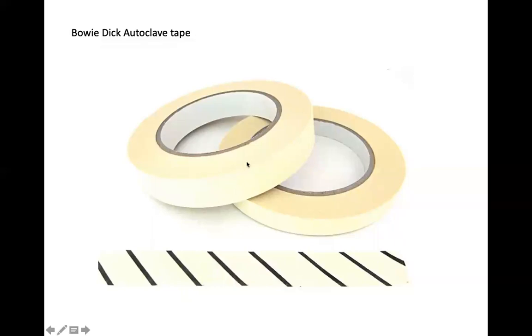After it has gone through the autoclave, you use this tape, you wrap it around items that are going into the autoclave, okay? After the sterilization process is complete, if that item or package got to 120 degrees, then you're going to observe this color change. If there was a malfunction with the heating system, or the perfusion of air or steam was not sufficient, then there are not going to be these black lines. The color change from colorless to black, you're not going to see it. So this is external QC.